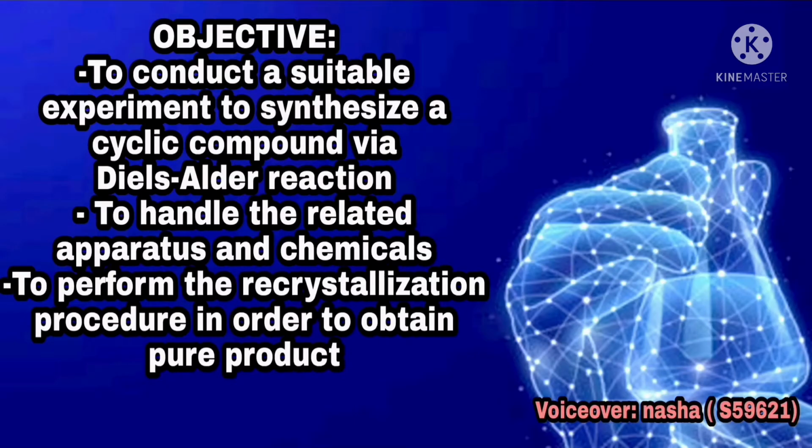Objectives in this experiment. First, students should be able to conduct a suitable experiment to synthesize a cyclic compound via Diels-Alder reaction. Second, students should be able to handle the related apparatus and chemicals. In addition, students should perform the recrystallization procedure in order to obtain pure product.